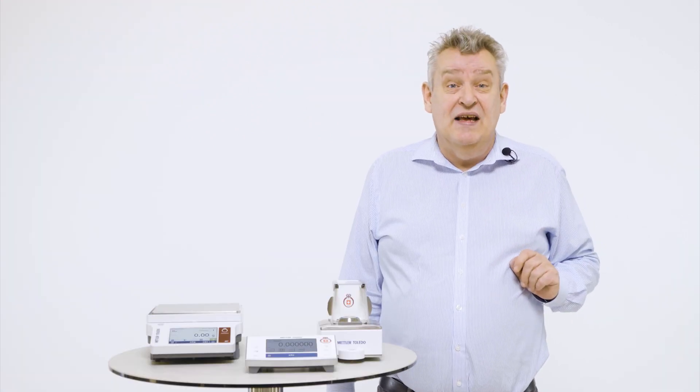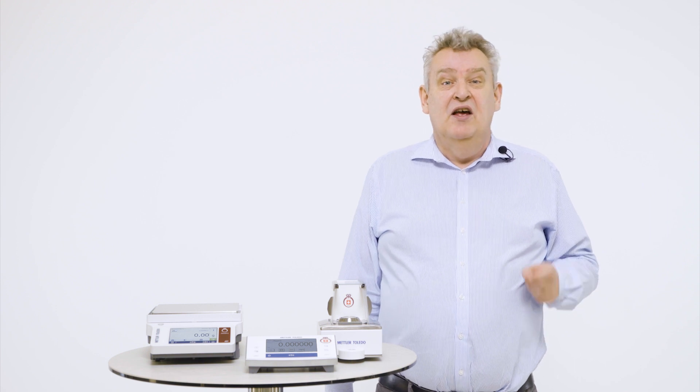We help fire assay centres improve their business and set up a proper certified gold assaying method. Fire assay is covered by ISO standards and is the reference technique used by all assay offices worldwide.